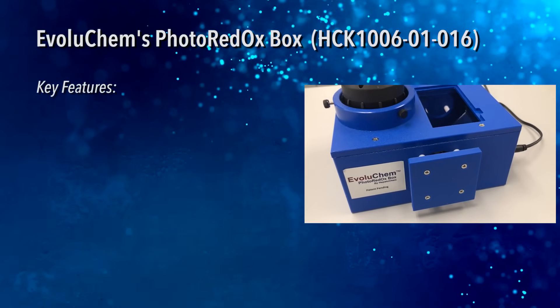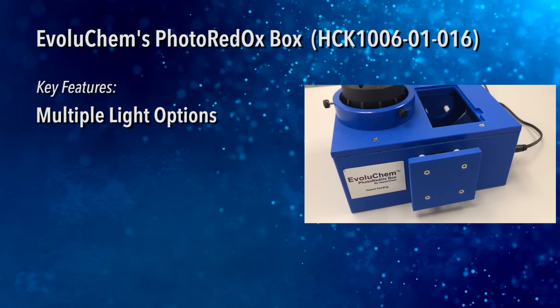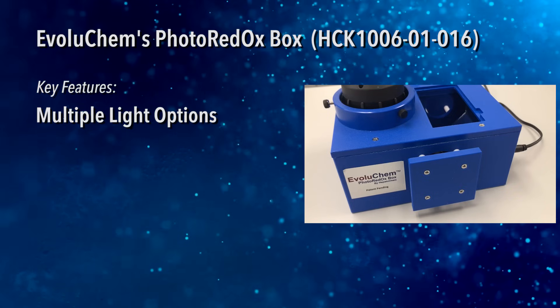Key features of the photoredox box include the following. It accommodates most light sources including a large selection of EvoluChem branded options.